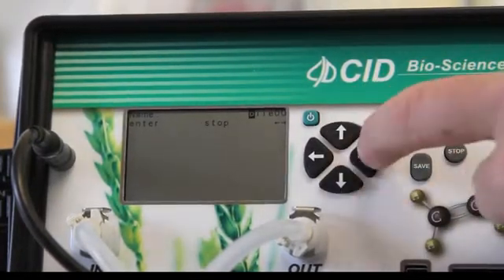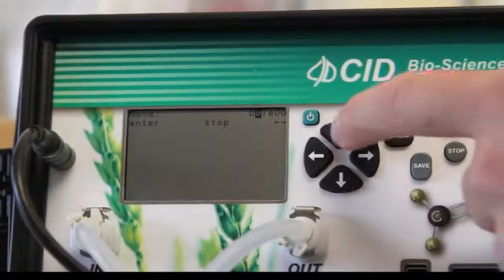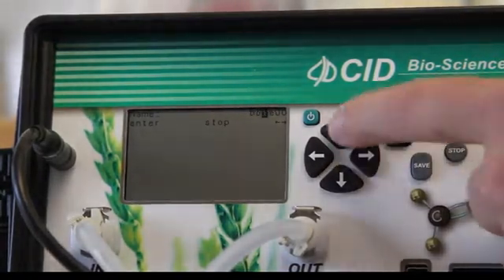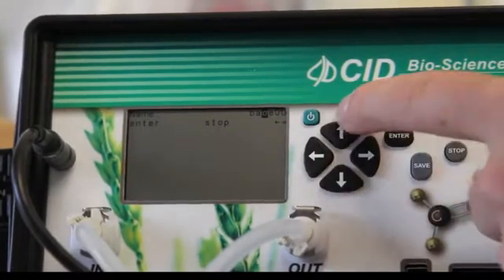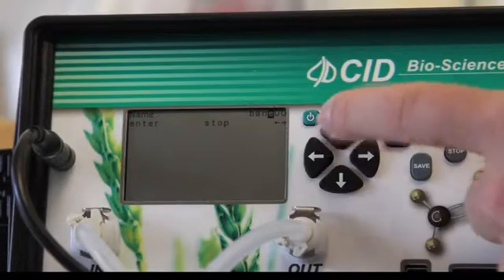As you can see here, we can change the default letters that read File00 to whatever we want. For this example, we are using a banana, so in this case we will be labeling the file accordingly.